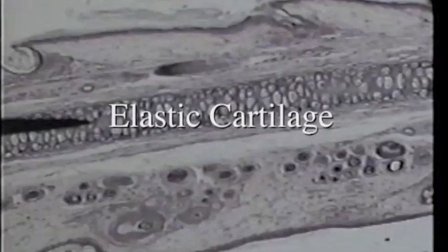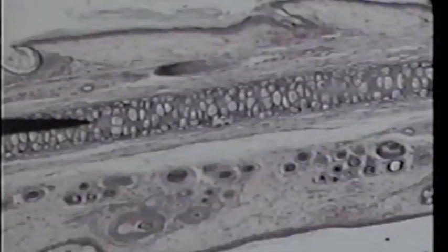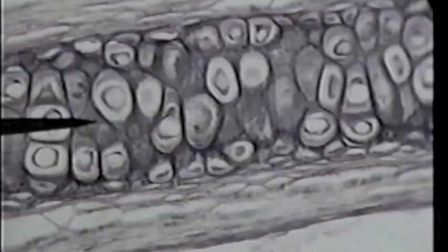We're now looking at a different type of cartilage on low power. This is elastic cartilage. Elastic cartilage has many elastic fibers in the matrix and they're visible, but to see those elastic fibers we're going to need to go to high power. In this view, the tip of the pointer is in the matrix, and if you use your imagination a little bit, you can see some black streaks in the area of the matrix — over to the right a little bit, you can get a bit of streaking.